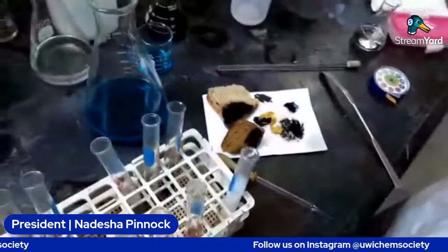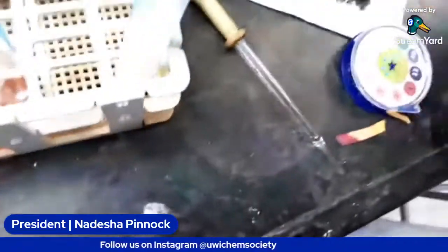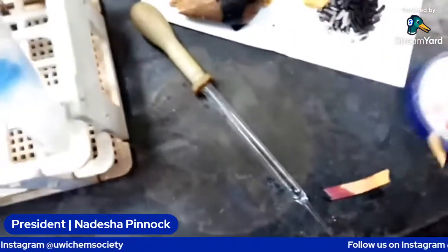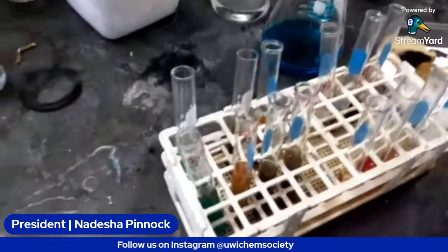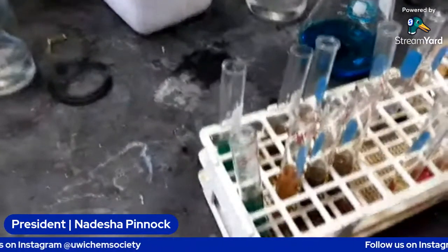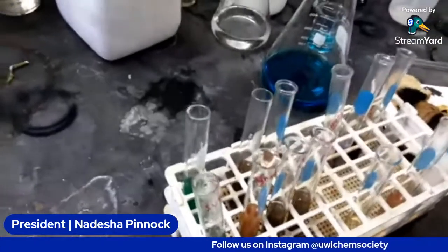So this is acidic. That's the pH paper, and that's the scale that we're using. So it's acidic. Our aim is to neutralize the acid, and then after neutralizing the acid, we're going to add the Benedict's.